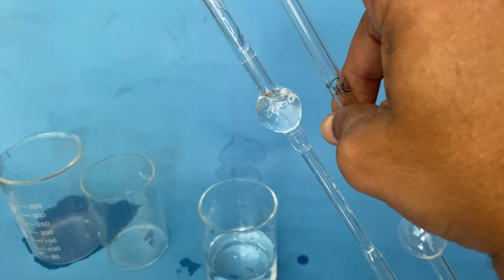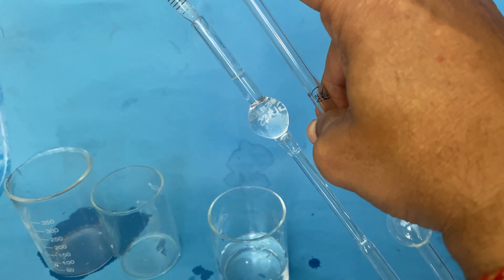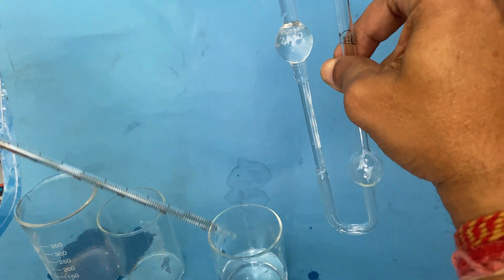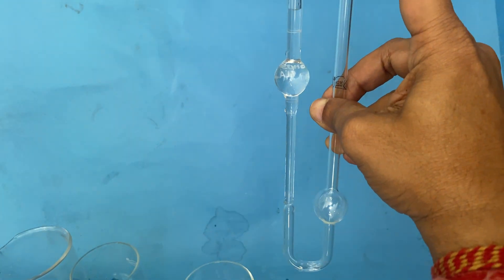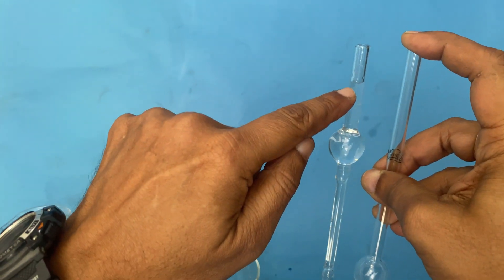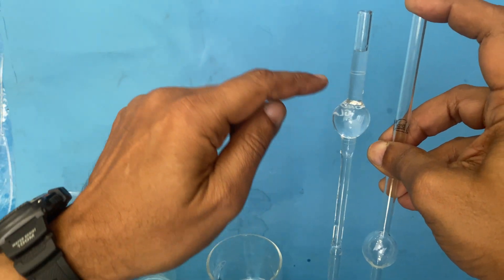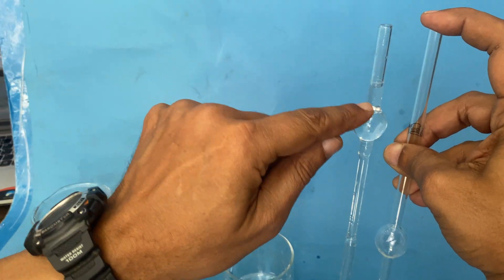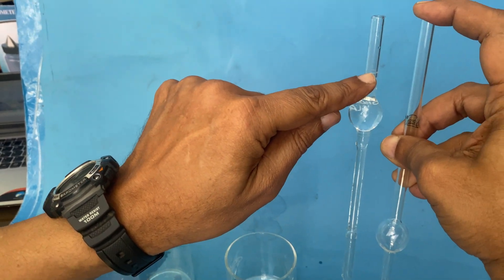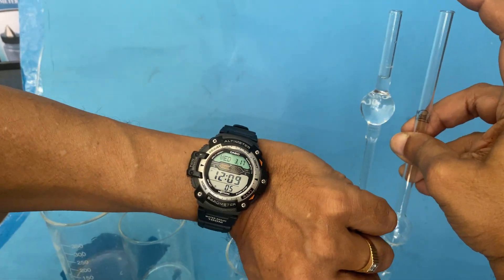Fill it to the bulb. See, this water is coming to the bulb. Just put a drop above the level. Now water is above, a little above. Just open this and close it. Now when this water is here, I start the stopwatch to calculate how much time it takes.